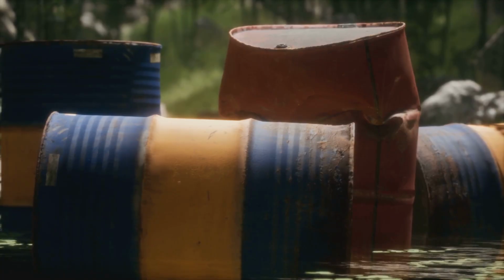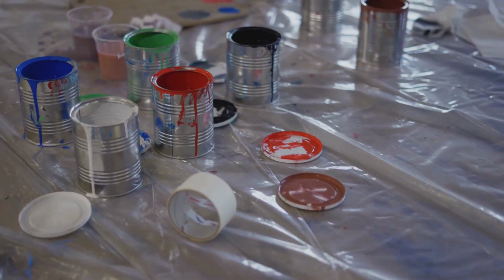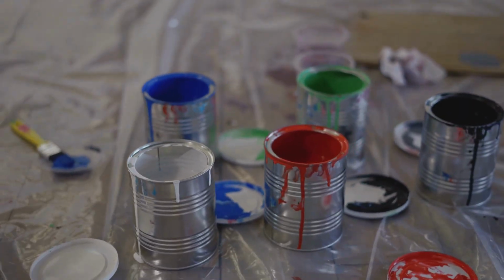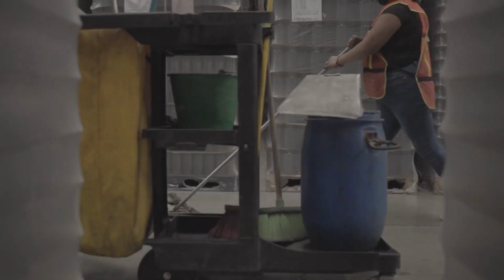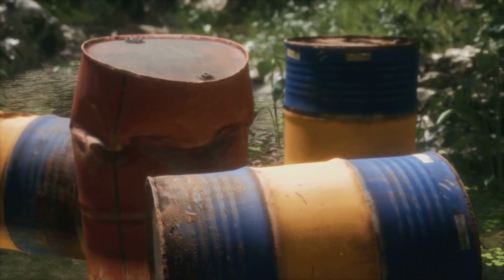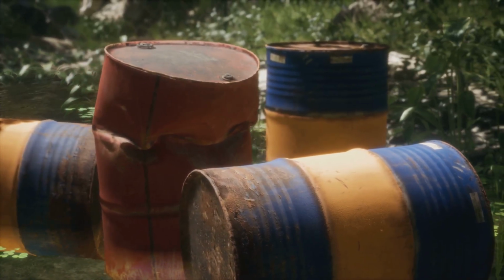Finally, spills and waste. Accidents happen, so be ready. Keep a spill kit with absorbents. Special pads, cat litter. Use absorbents to contain a small spill. Never pour solvents down the drain. Don't throw them in the regular trash. Collect waste in a clearly labeled, sealed container. Follow disposal guidelines from your school, workplace, or local hazardous waste facility.